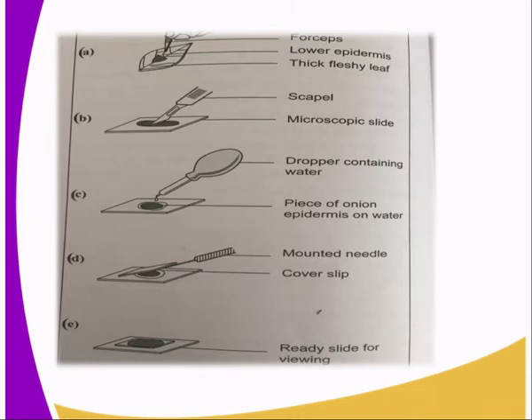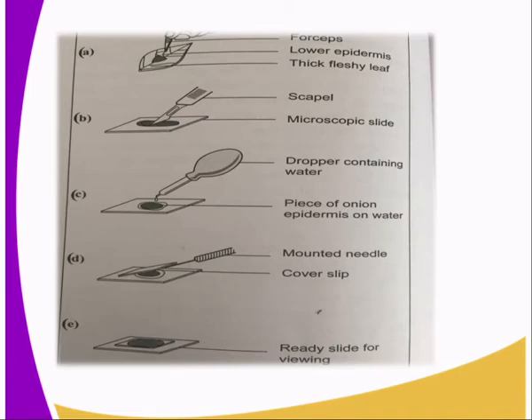The reason you should do it very quickly is to avoid the epidermis from drying. From there, you use a mounted needle to lower a clear cover slip onto the epidermis strip. You can also use your fingers as long as they are clean, but ensure that you do this gently to avoid trapping air bubbles.